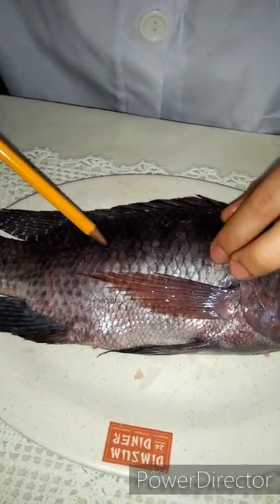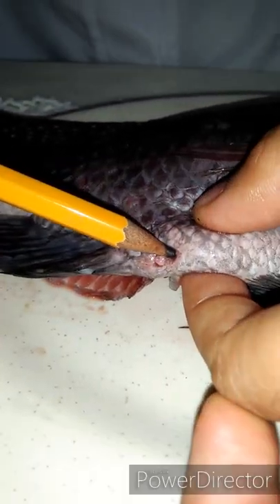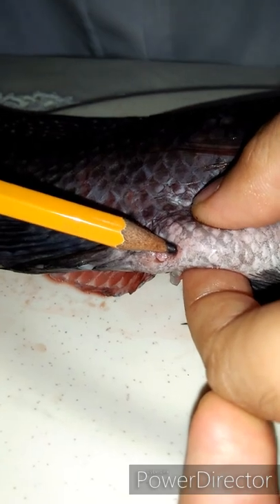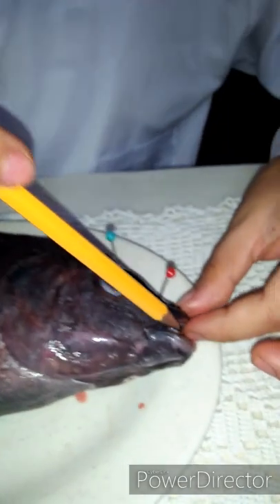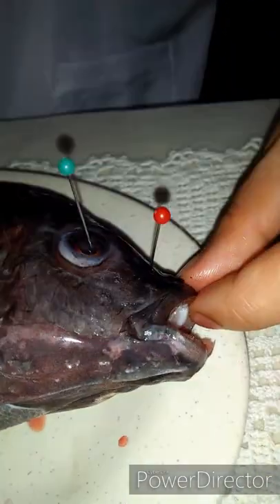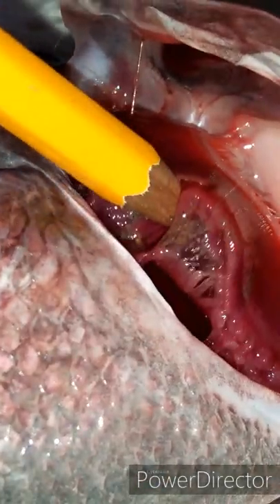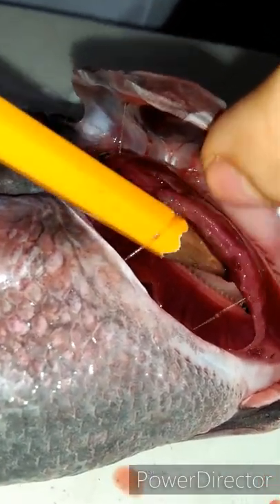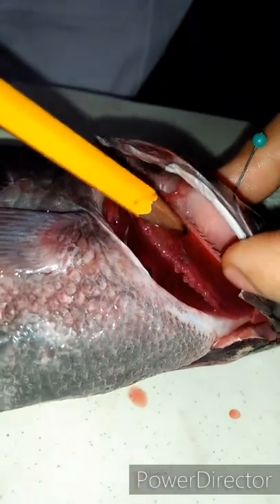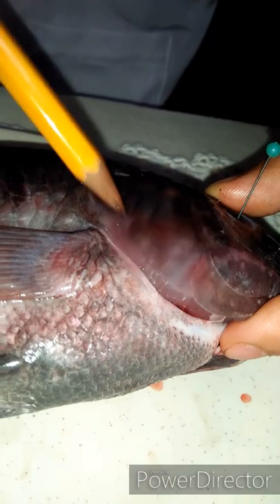These scales help the fish to prevent infection, scrapes, and parasites. This is the vent — this is the urinary and reproductive tract of the fish. This one here is the mouth. Inside here we have the gills; this is the gills, which is the breathing apparatus.